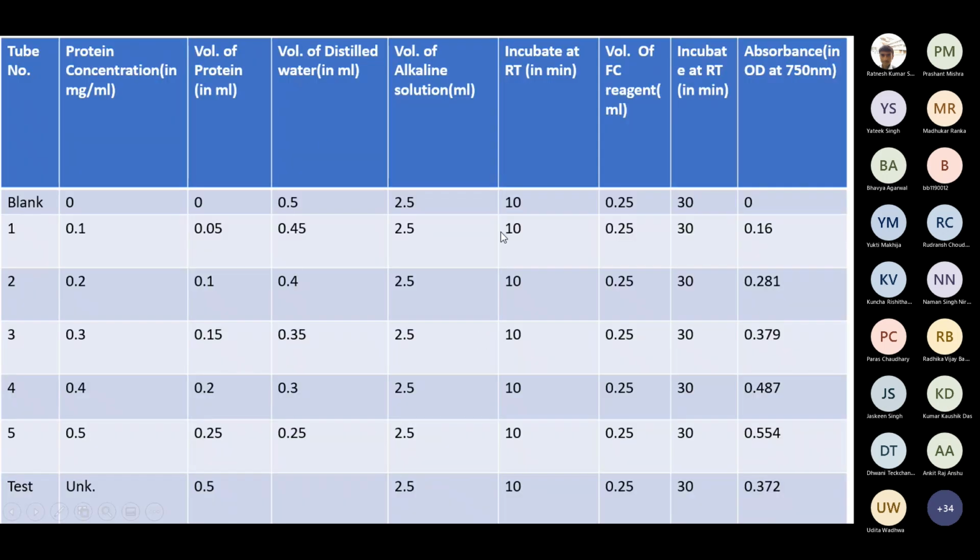So this is the dilution table that I showed you in the video. Here you can see the absorbance that is measured using the UV visible spectrophotometer. Has anybody faced any problem while understanding that video? Any questions?